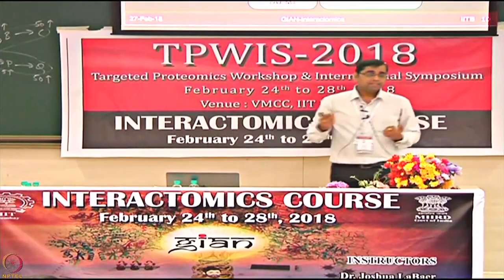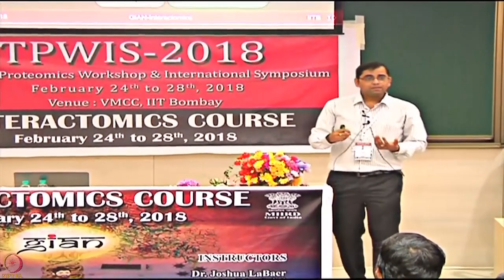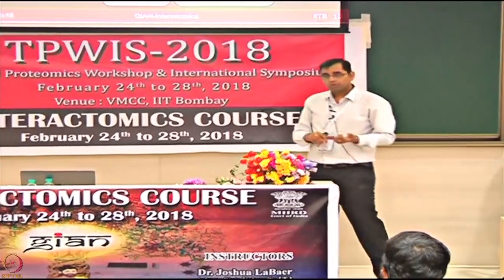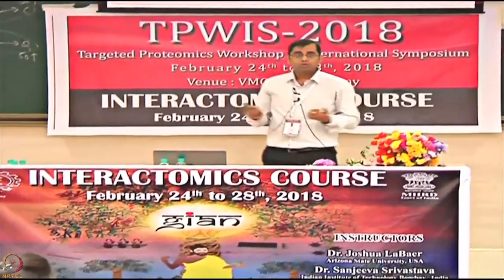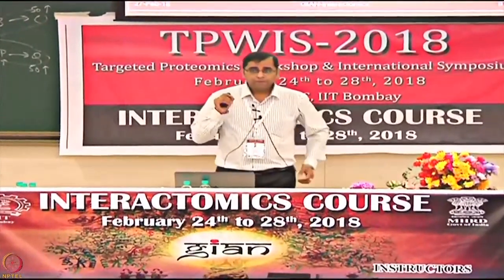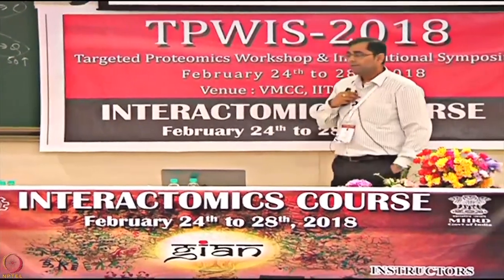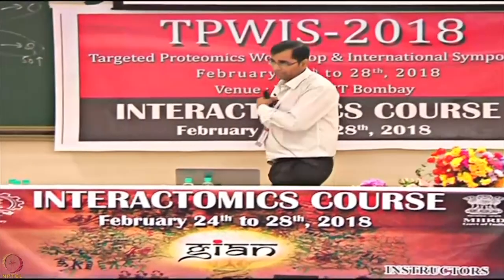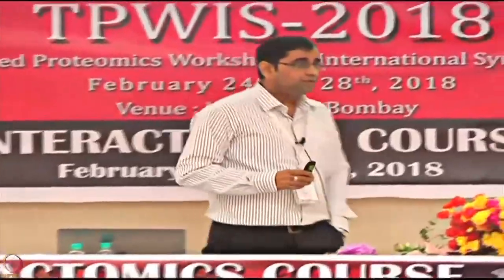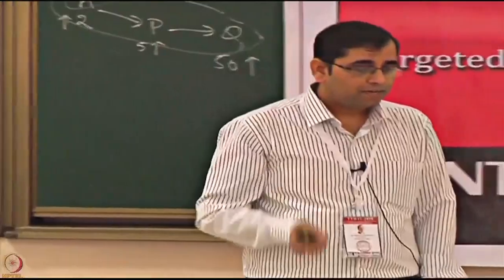And these things are usually not good, because when you want to try your actual experiment, which often depends on low abundant proteins, and antibodies are not so great for them, your assays don't work as robustly as you saw at the proof of concept level. So many of these technologies are still at the proof of concept level, which needs to show what could be done at the actual biological sample level. Therefore, not everything I have shown here has reached the biological lab, and not everything holds up to the biological experiment, because biological samples have a lot of low abundant proteins. You will not have that strong an analyte to test.